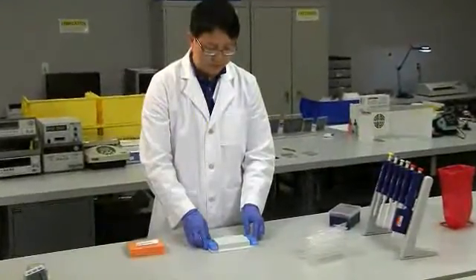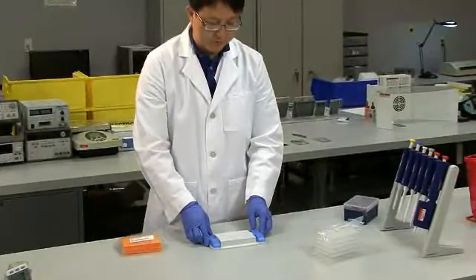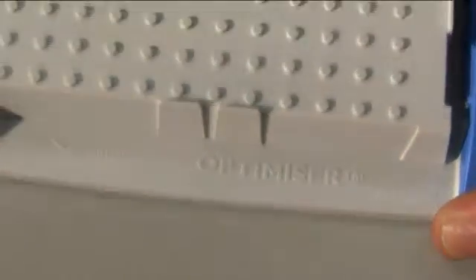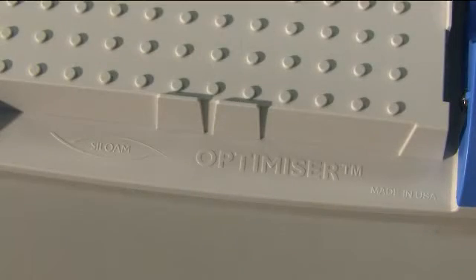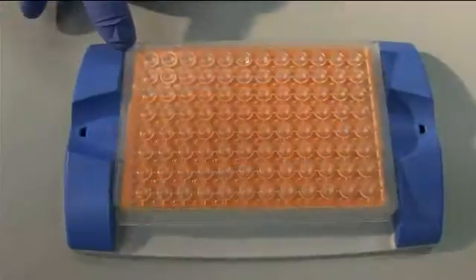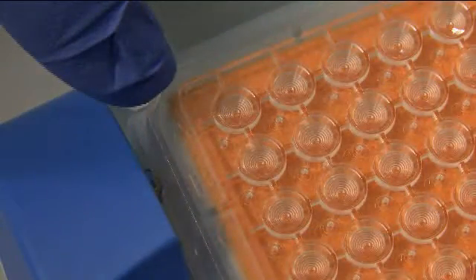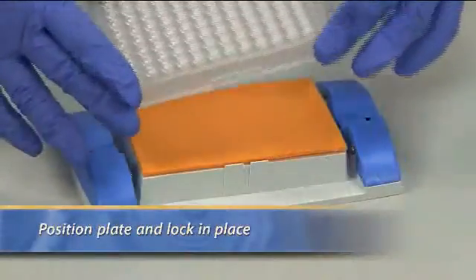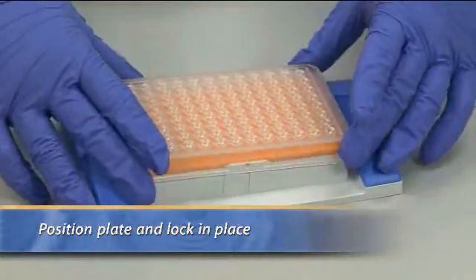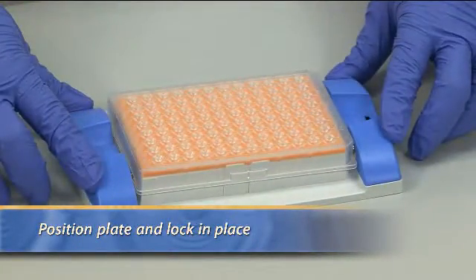To use the Optimizer, unpack the holder, absorbent pads, and the Optimizer plates. Position the holder so that the side with the Siloam logo is closest to you. Position the pad so that it fits within the slot on the holder. Orient the plate with well A1 at the top left corner. Place the Optimizer plate on the holder and push it down until you hear it click in place. Now you're ready to start using the Optimizer microplate system.